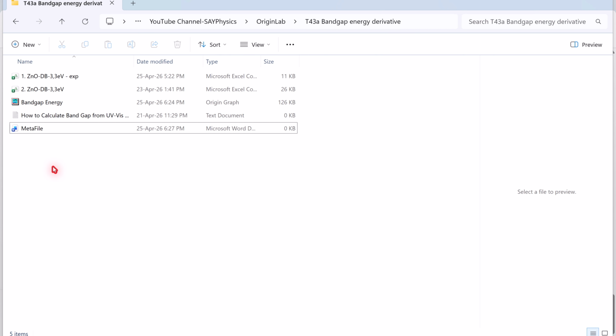In this video, we will discuss how to calculate the band gap energy from UV-Vis data. This calculation is based on finding the derivative so that it gives us a clear idea of how we can find the band gap accurately and easily.